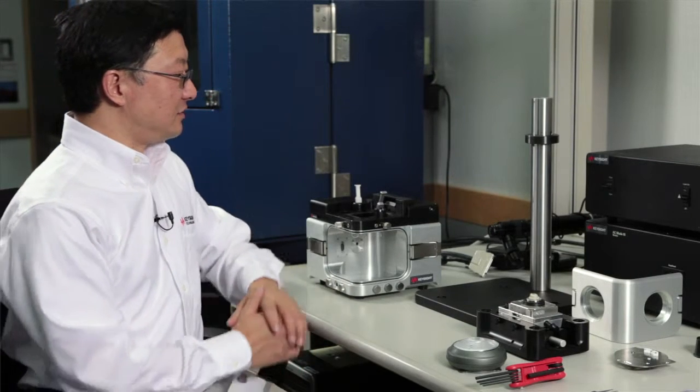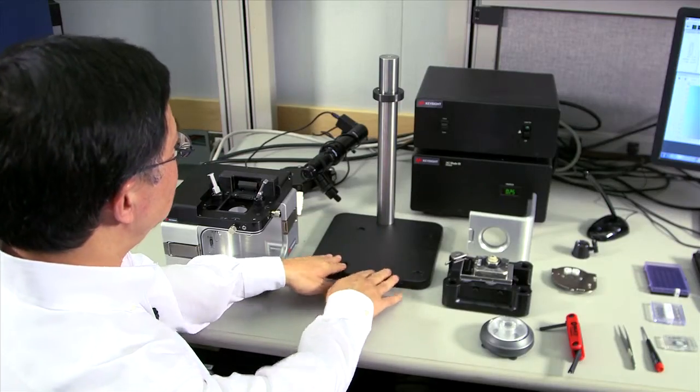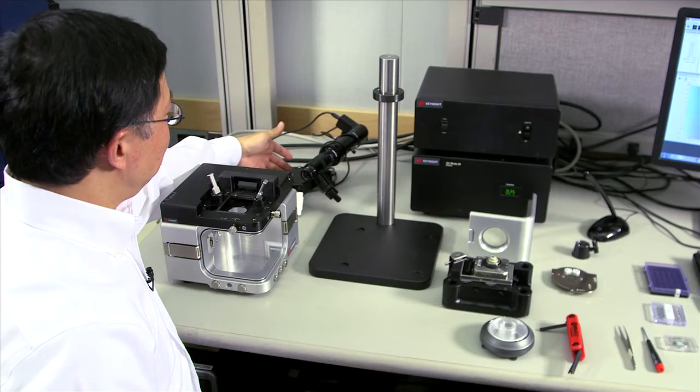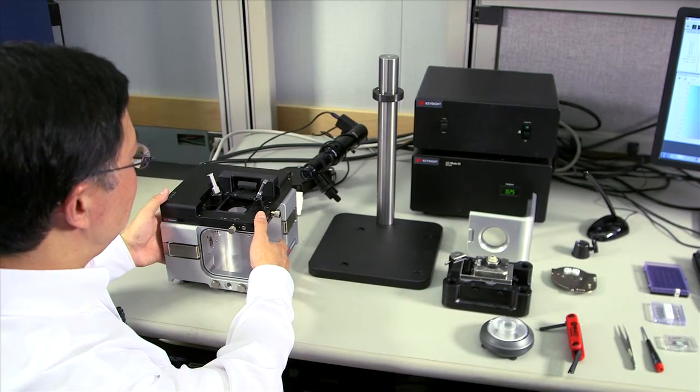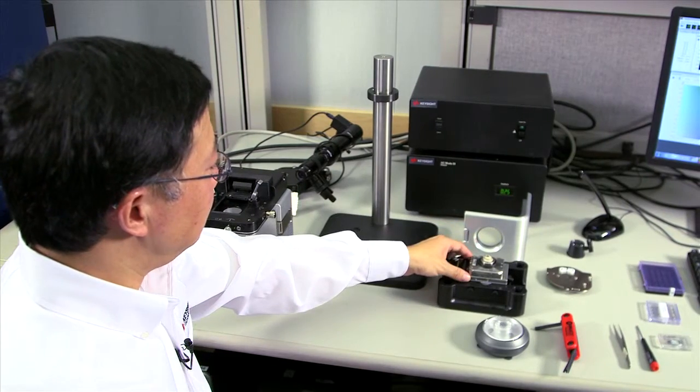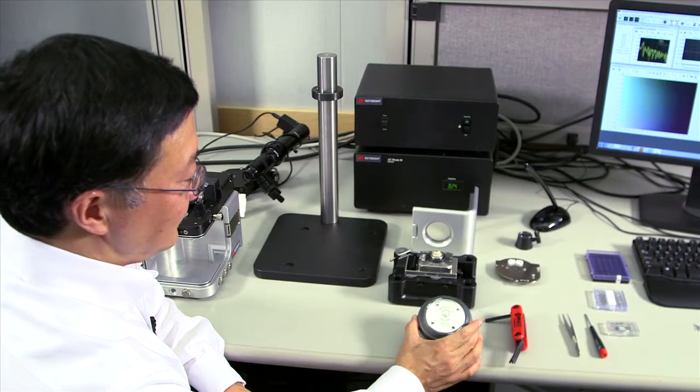Here's the basic component of the 7500 AFM. The base plate with its optical column, the optical microscope assembly, the AFM body, the gate, and the scanner. And here are some tools we need: Allen keys and an LED light.